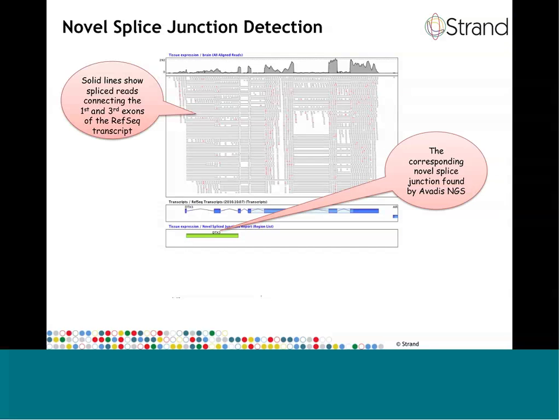In this experiment, we had chosen the more conservative RefSeq database as the source for the known transcripts. The RefSeq database only contains those transcripts that are rigorously checked and verified to be real transcripts. And this means that this new transcript has not been submitted to the RefSeq database.